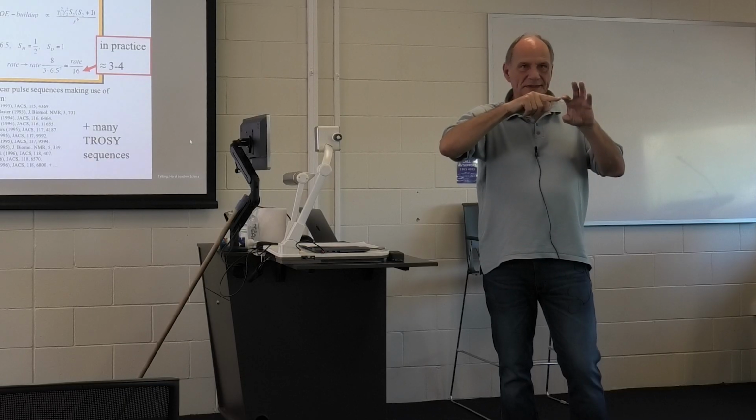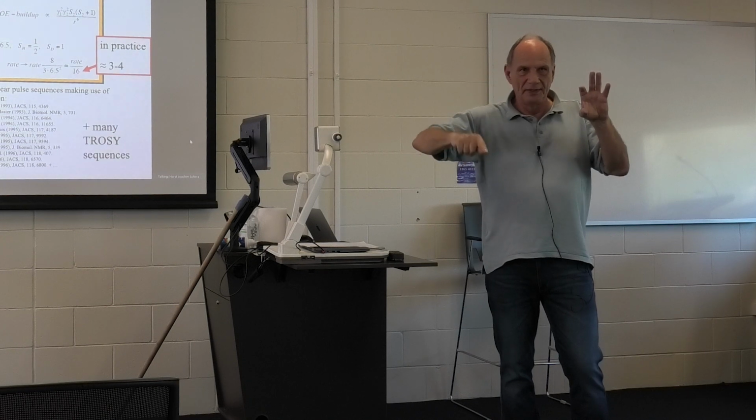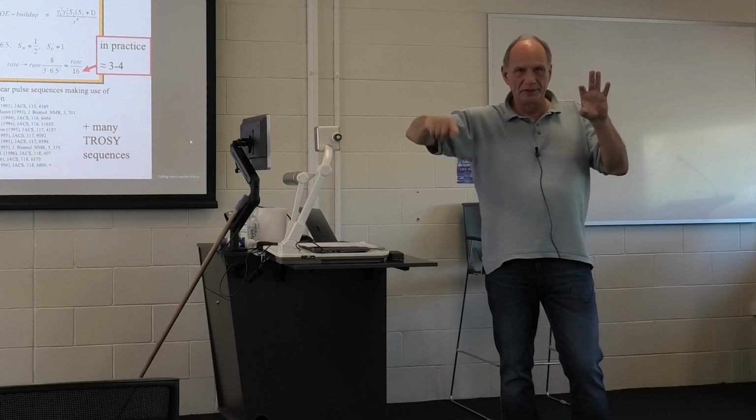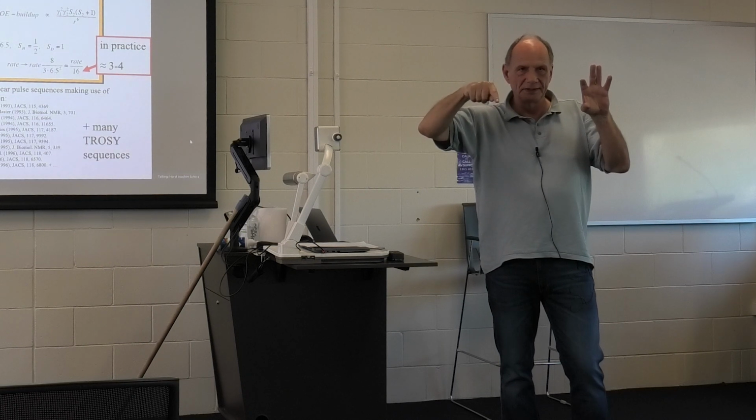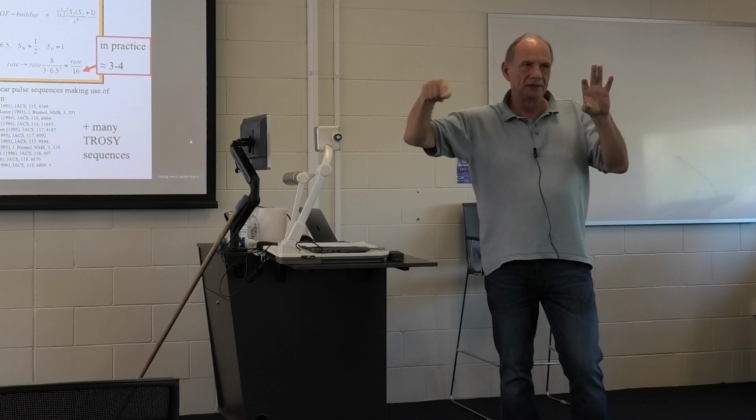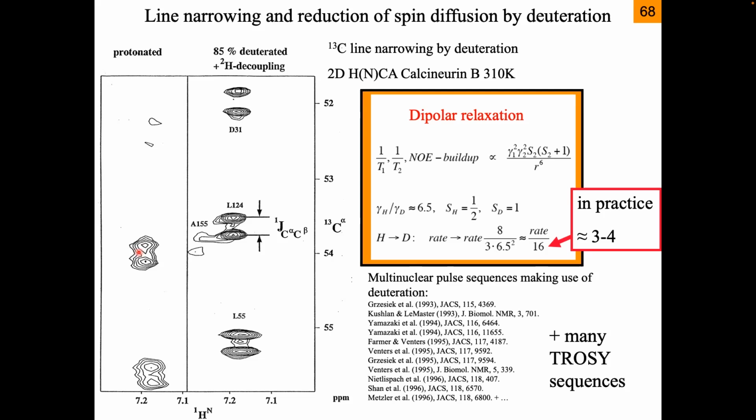So when you look at this carbon FID, it will oscillate with a cosine modulation that has a zero crossing at about 15 milliseconds because of the C alpha C beta carbon coupling. But in the protonated case, you have the relaxation happening in addition, and then the signal has almost decayed and you hardly resolve the splitting. But in the deuterated case, you can nicely see it.